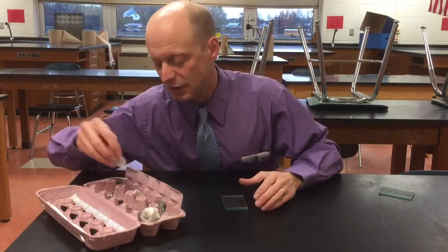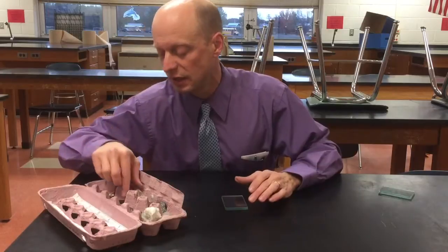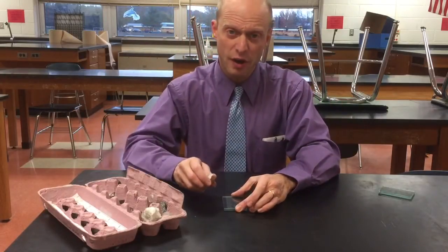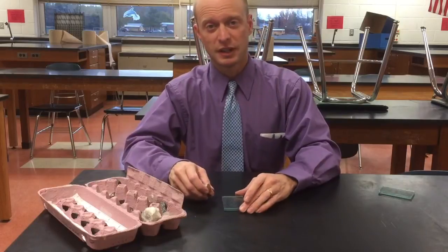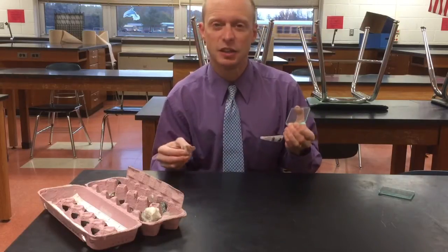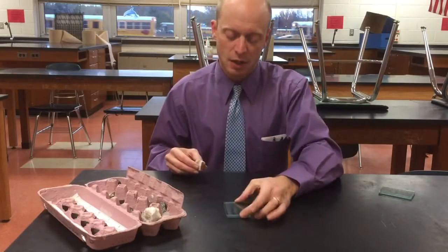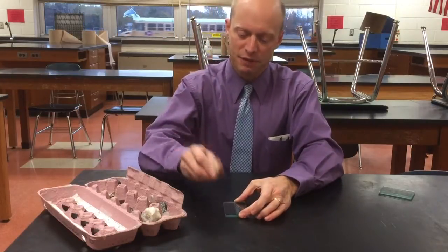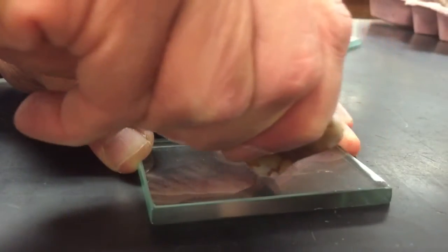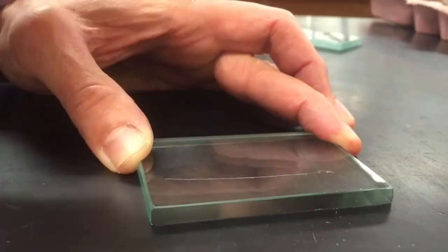I'm going to try quartz here. Hold it firmly like this — press hard but not too hard. Some people press too lightly, like this — that's not going to do it. You need to press harder than that. Hold it down, grab it firmly, press, eyes closed.